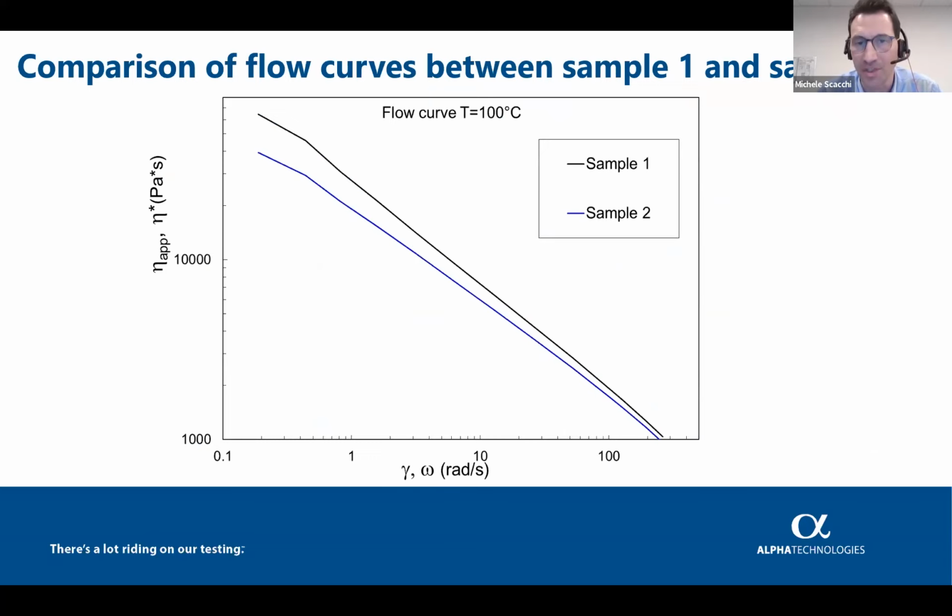So this was confirmed. So not only for injection, but for several types of processes, extrusion, and other processes in which we can generate the flow curves.